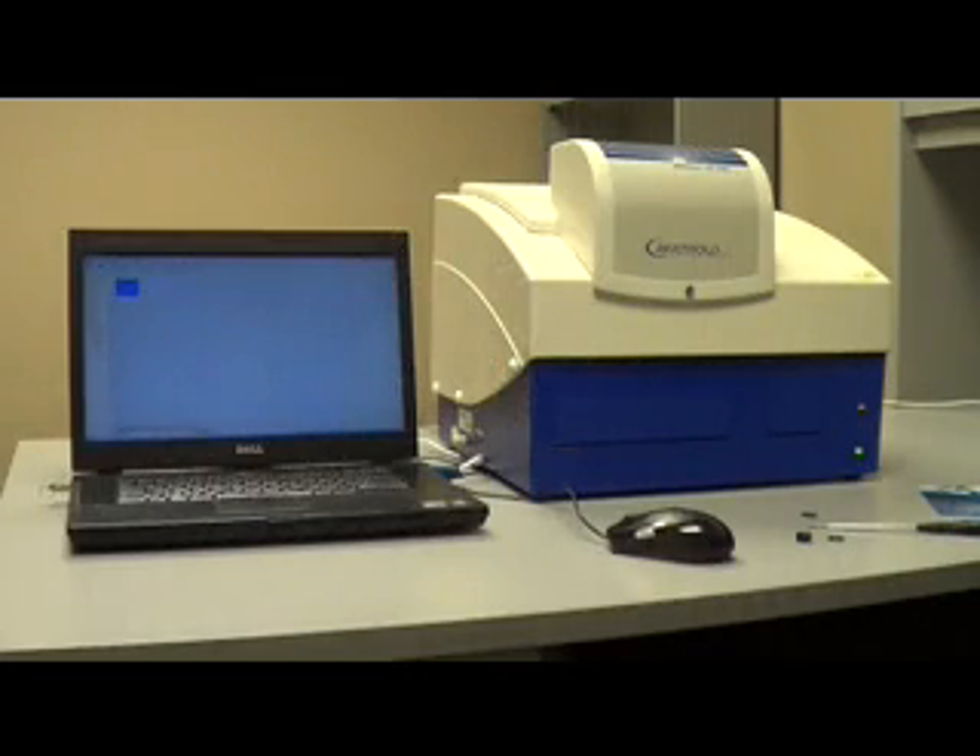Today we are going to teach you how to replace a filter in the excitation slide of a Mithras LB940. This can also apply to the TriStar LB941 since the excitation filter slides are the exact same thing.